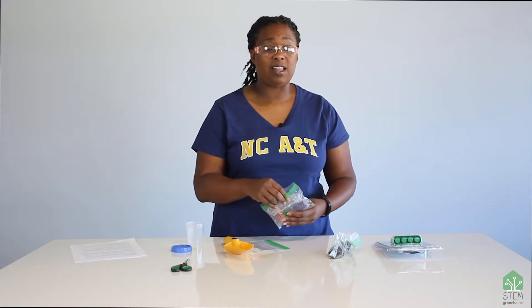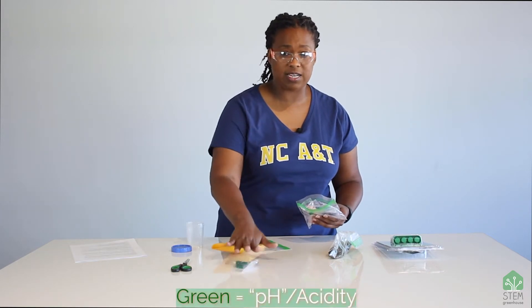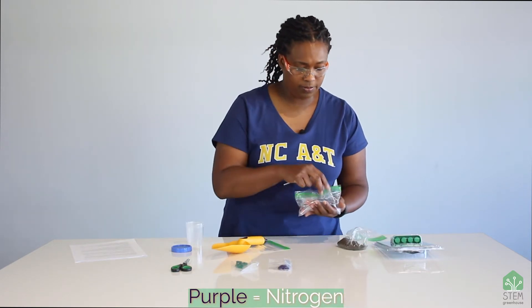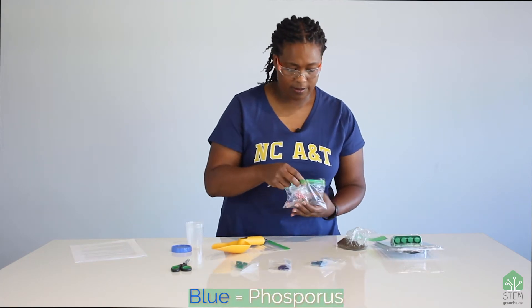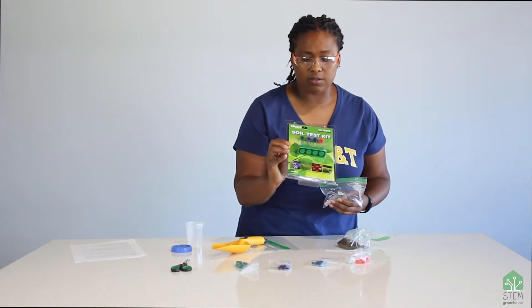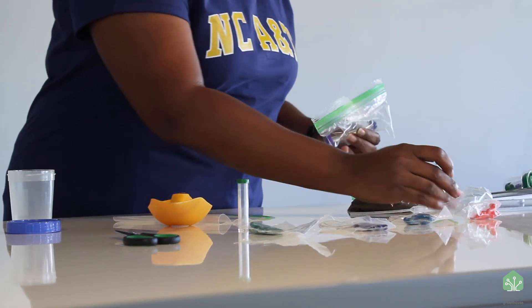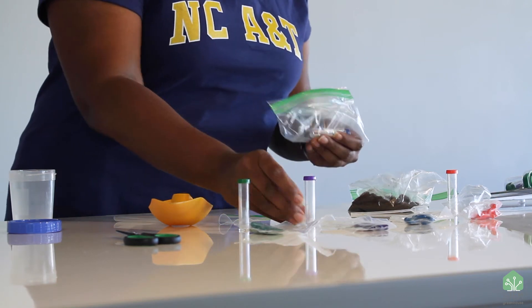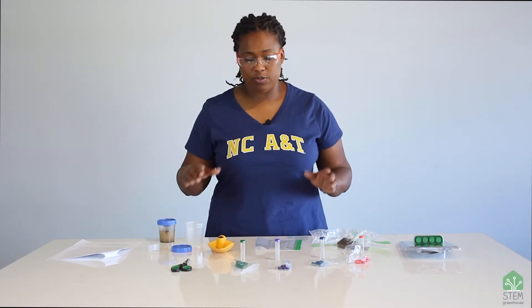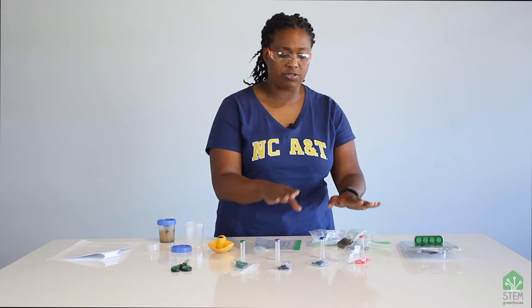Everything in this soil kit is color-coded. The green capsules are indicators for the acidity or pH. The purple indicators are for nitrogen. The blue is for phosphorus. And the orange is for potassium. When you open up your STEM kit, you will get these little capsules. In addition, there are little test tubes with colors on the caps, and that will tell you how to measure each one. We're going to test the pH separately from the nutrients — nitrogen, phosphorus, and potassium.